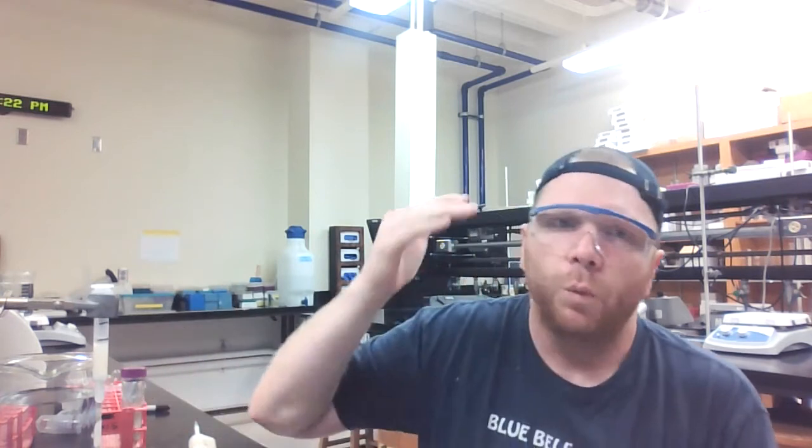Now, your elution buffer is a little bit tricky, because this is, I think, where most people are going to experience the greatest variability. Some people will have all their protein elute in the first 3 fractions. If you disrupt your resin or your bead bed, well, then that's going to throw off when proteins elute from the column. So that's something to be careful and considerate about.